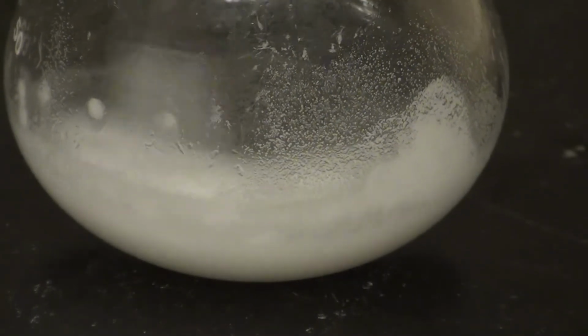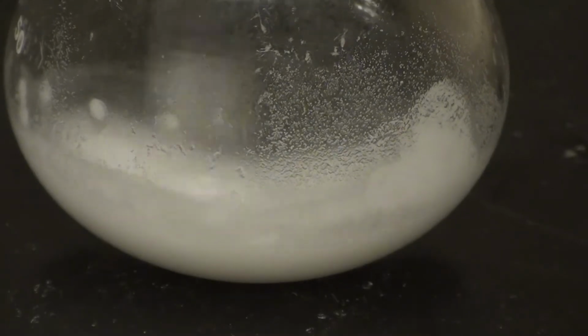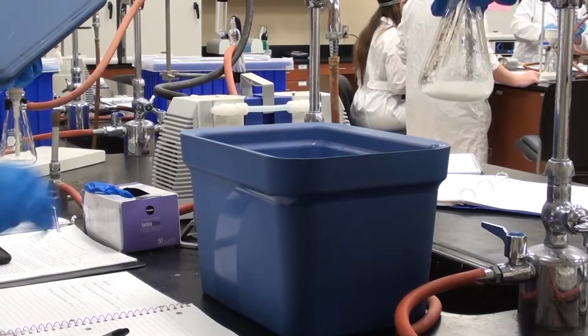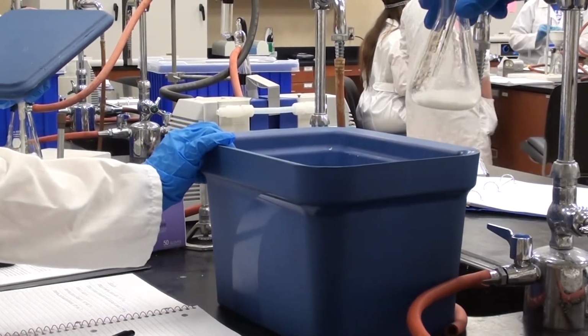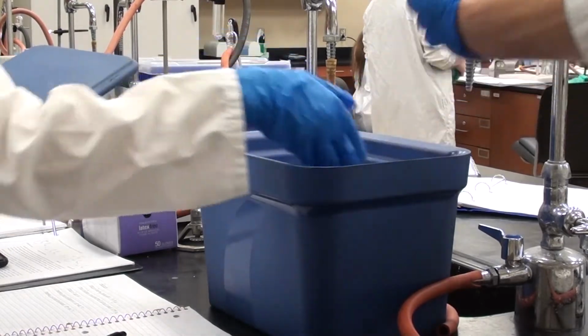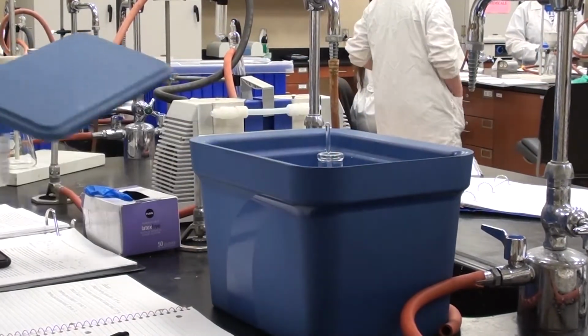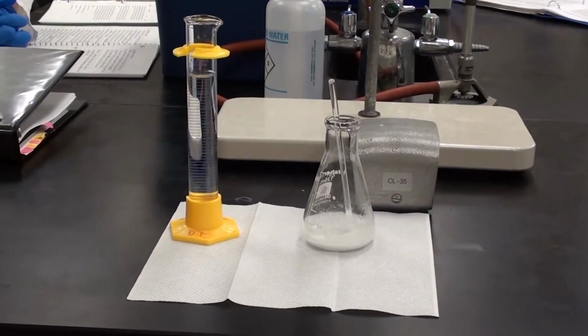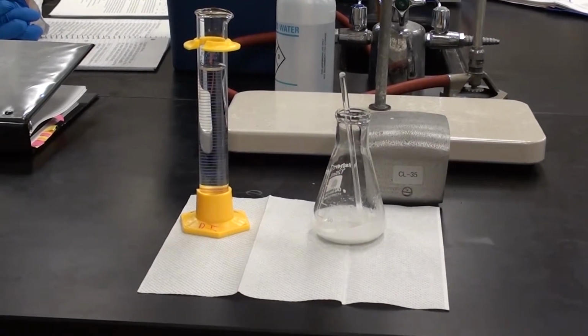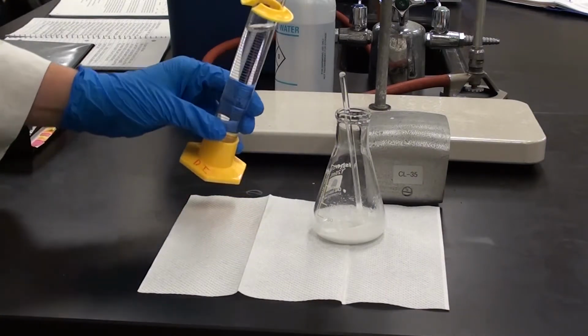Yeah, that's good. Okay, once it gets to that slushiness, we can go ahead and stick that in ice. So we're going to stick this in the ice for 5 minutes. And then after that, we're going to add 50 ml of water to it and filter it. So the aspirin has been sitting in the ice bath for about 5 minutes, and now we're going to add 50 ml of water and stir it around.